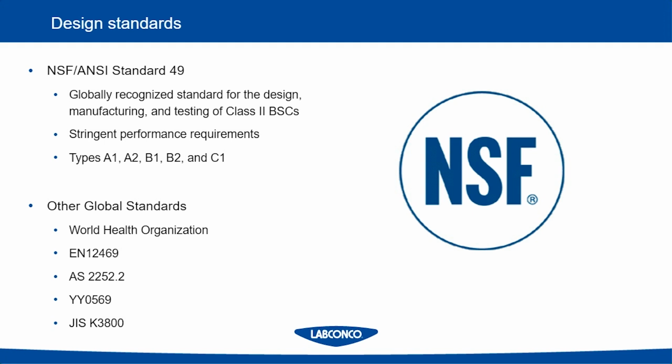Other global standards exist outside the United States, even though NSF is recognized by several other countries. The World Health Organization has specifics on their cabinets. In Europe, the EN 12469 standard typically applies to biosafety cabinets, and then there are more throughout the world.